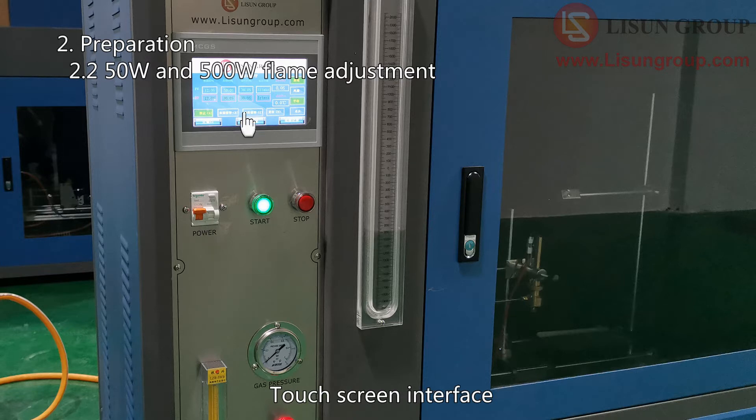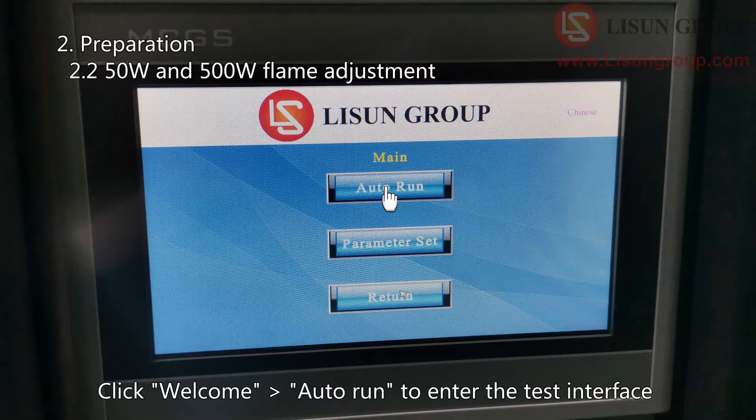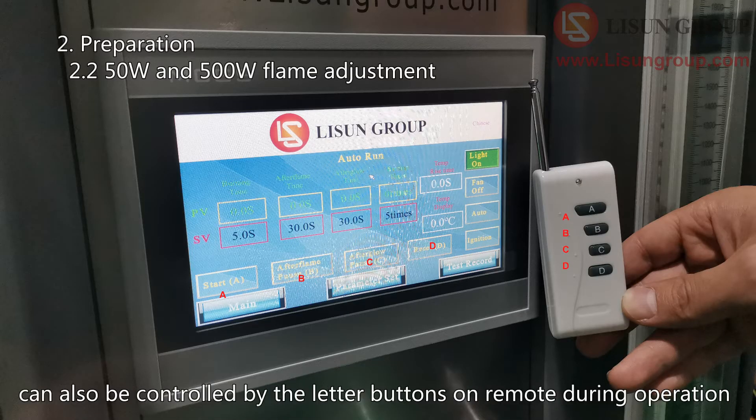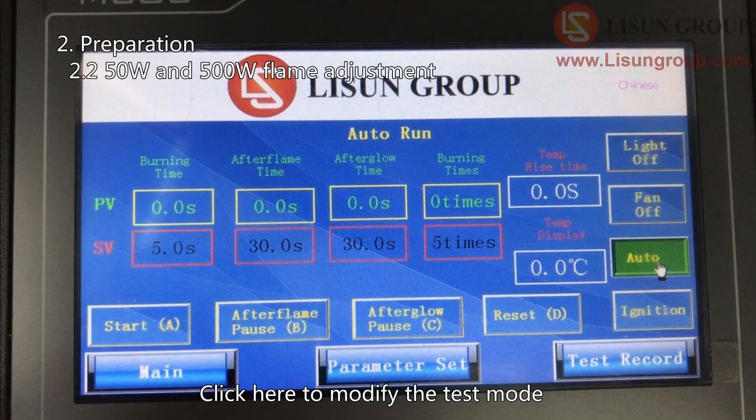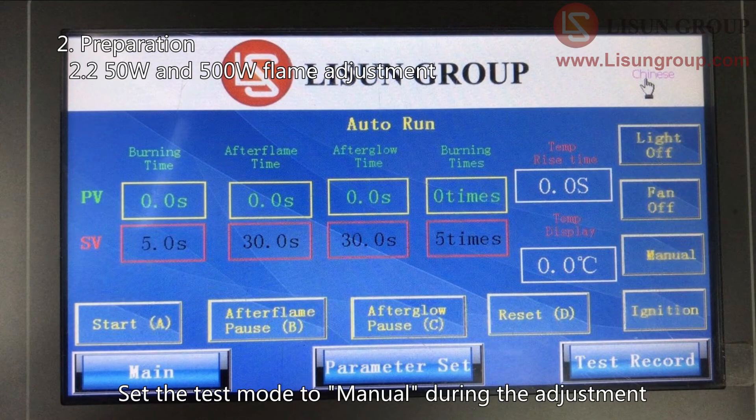Touch screen interface. Click Welcome Auto Run to enter the test interface. The four buttons marked with letters on the touch screen can also be controlled by the letter buttons on the remote during operation. Click here to modify the test mode. There are two modes: auto and manual. Set the test mode to manual during adjustment.